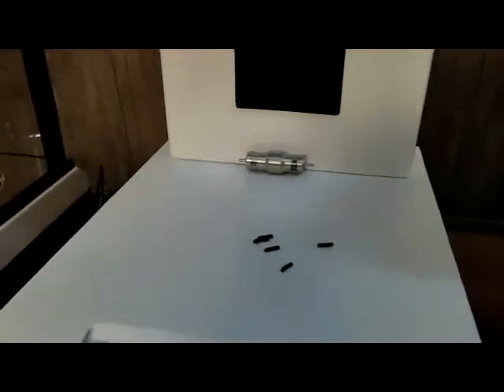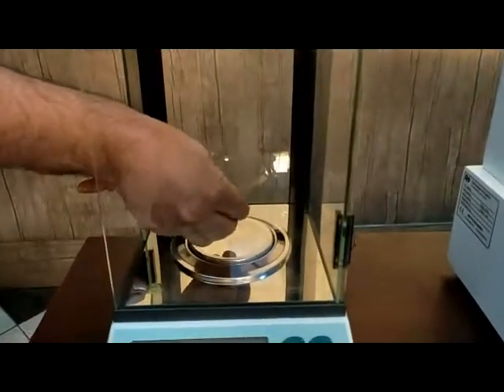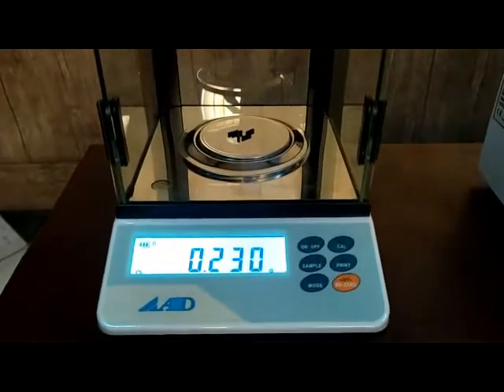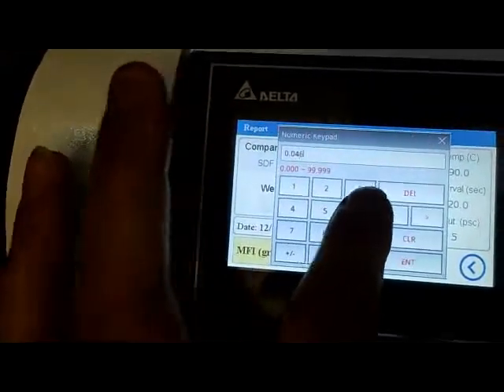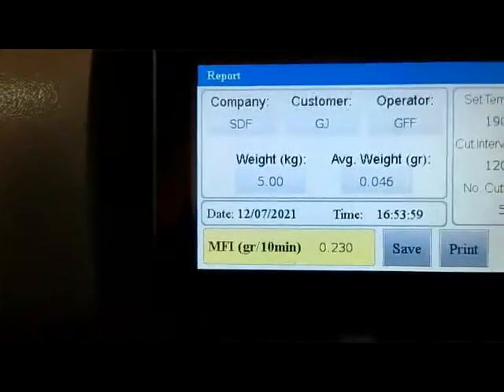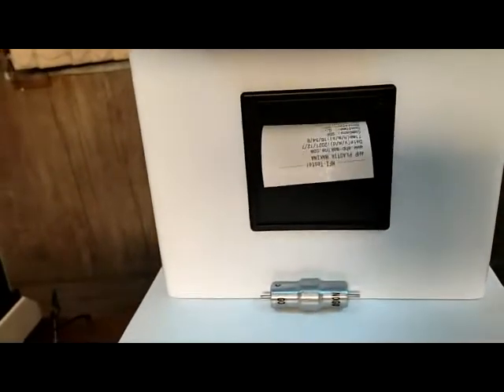After the test is finished, you need to weigh the samples with a precise scale. Calculate the average weight of the samples and enter the number in this menu, and the machine will calculate the MFI for you. Now you can save the reports and print them with the thermal printer.